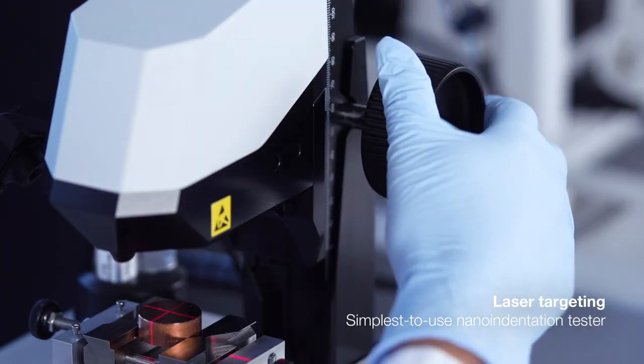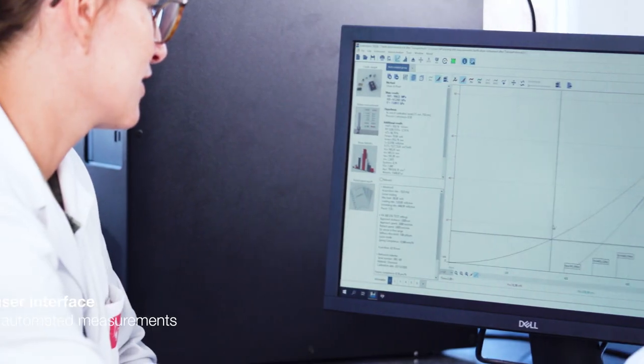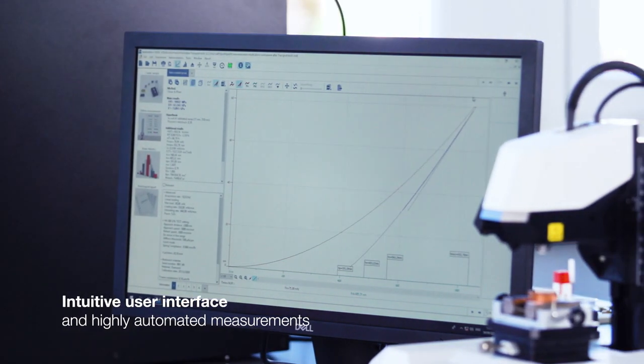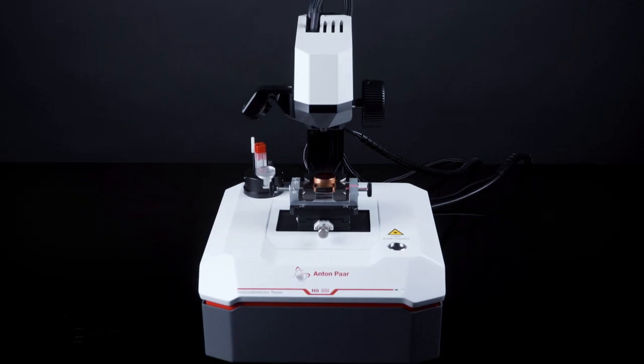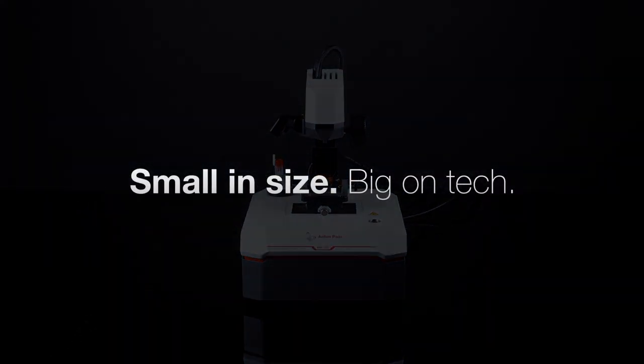You understand HIT and HIT understands you. No hassle, a user interface with no sub-sub-sub menus, just straight and easy. HIT 300 is nano indentation for everyone. Small in size, big on tech.